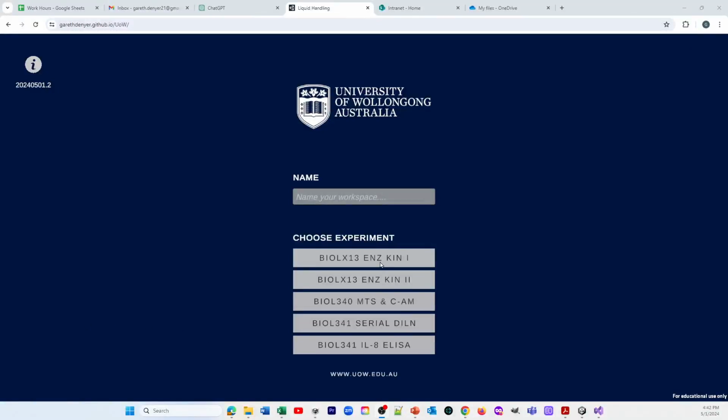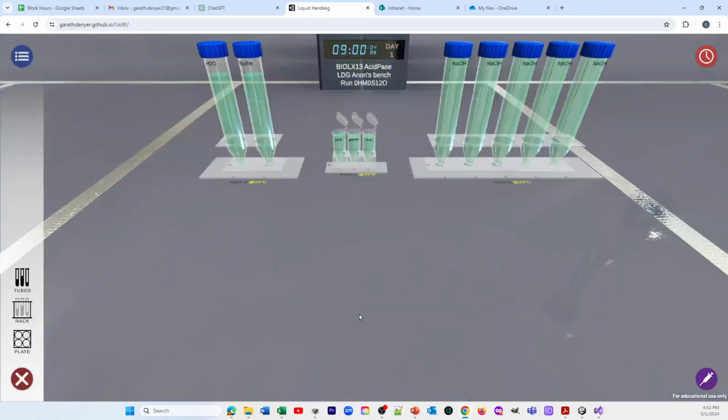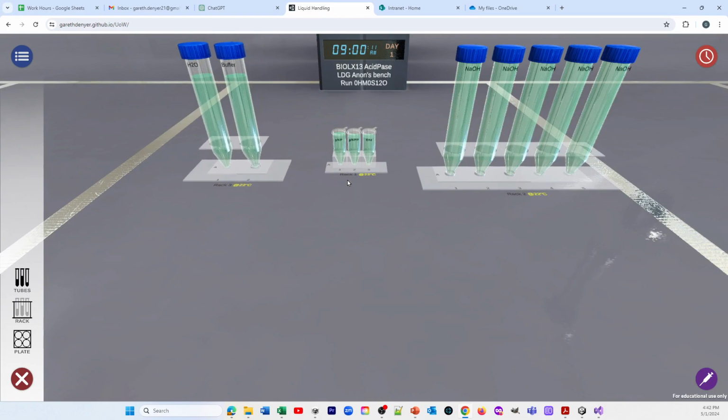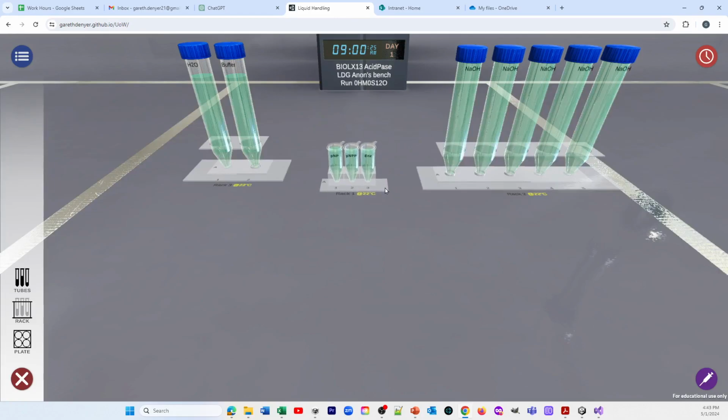Okay, so to do the enzyme measurement, we're going to still go to Enzyme Kinetics 1 and create the same set of tubes. So there'll be this enormous rack of sodium hydroxide, there'll be water, a buffer, and there'll be the rack with the substrate, pNPP, and the enzyme. Now, on this particular occasion, we don't need the PNP, but it's part of the same experimental setup. So the key thing is not to get confused between the two.